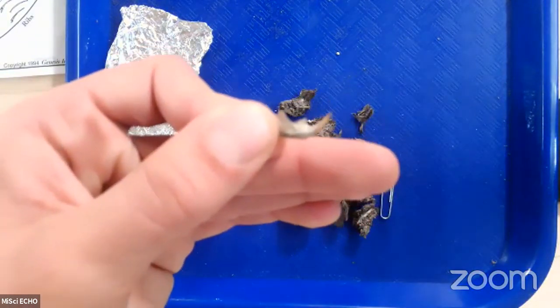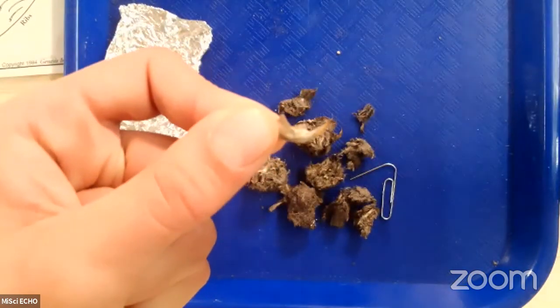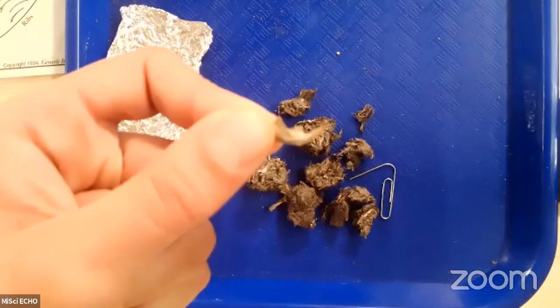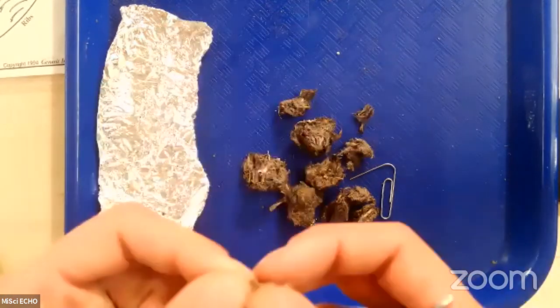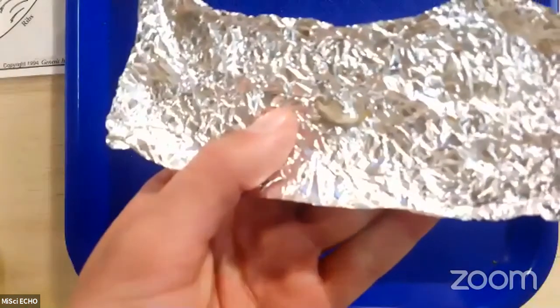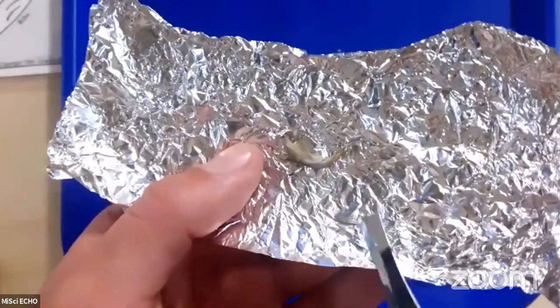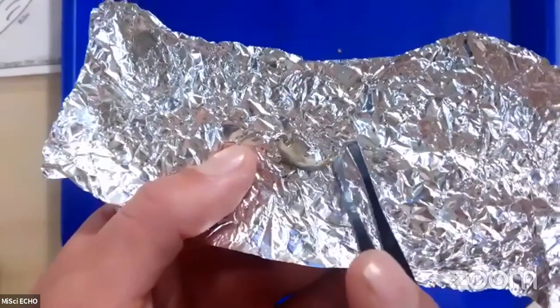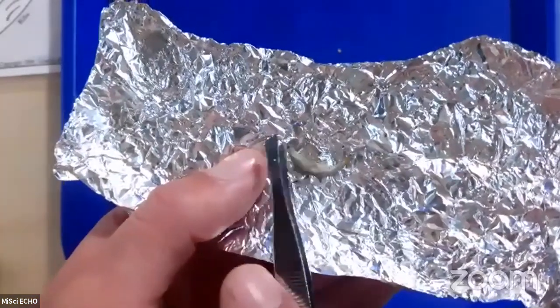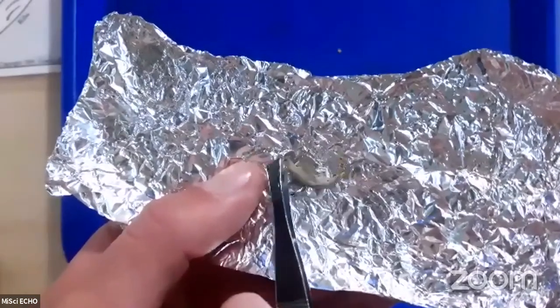So let me try to focus my camera here on this piece of the jaw. One more time. Might not want to. Let's see. Maybe if I put it on the tinfoil. But you can see that that is a piece of a jaw of one of our organisms here. There's a tooth. This is where your jaw would connect. And so that's the joint where it would connect so that these animals are able to chew their food.